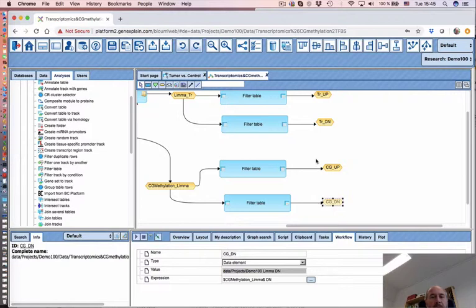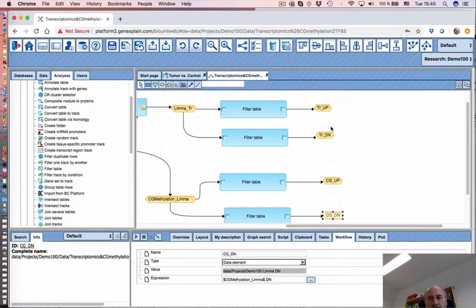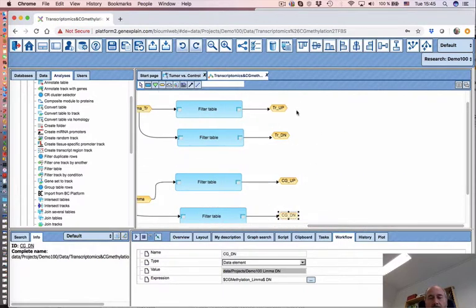So the next, now we have those accession numbers, and here we have the respective genes. So the next would be to actually combine the transcriptomics and methylomics, DNA methylation data together.